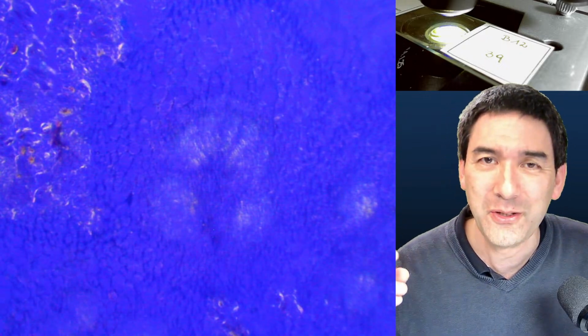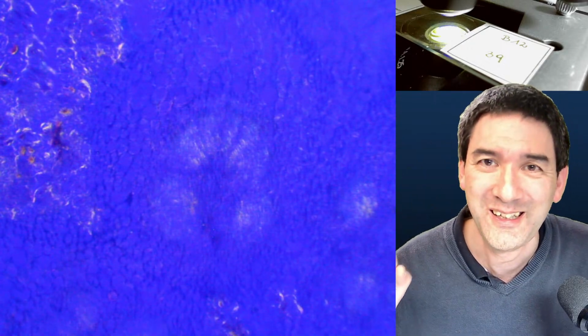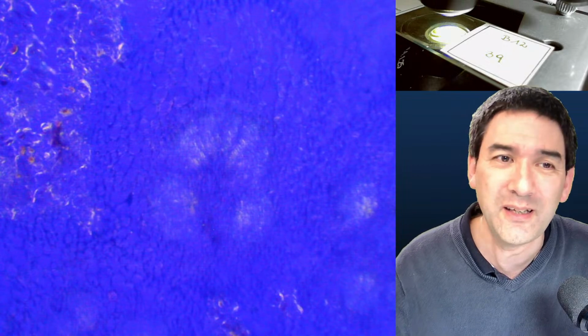So it could be that the nucleus is just as invisible because the light does not bounce off the nucleus, right? So it cannot replace chemical staining. But under certain circumstances, it can make things appear nice.